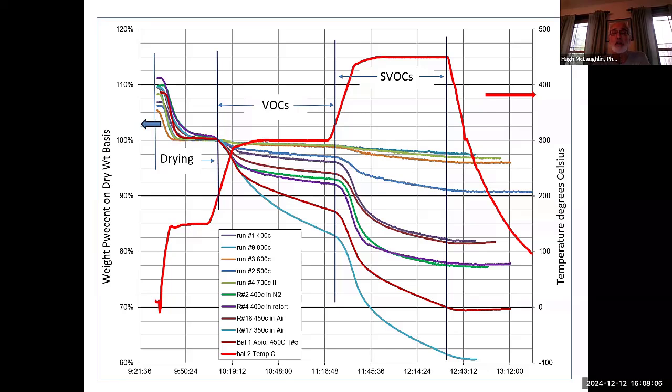reproducible ways. And what we've got with all this data is a series of high temperature chars that are losing relatively little VOCs and SVOCs, down to that bottom line, a 350 C char, which has an awful lot of VOCs and SVOCs coming off. So we're seeing a different response as a function of how much can be stripped from the material. It relates for this group of chars to the temperatures they were made at. You don't really know the temperature of the char that you bought. He'll tell you, oh yeah, it's a 600 degree C char, but de facto it could be whatever.